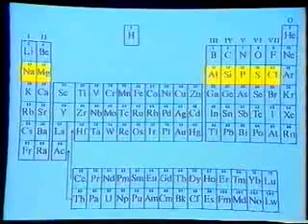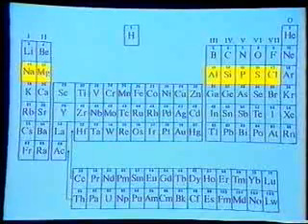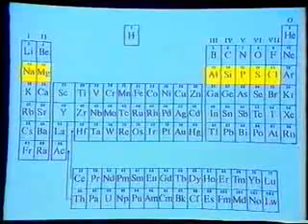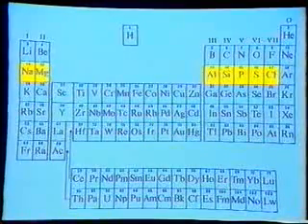In this program, we're going to look at some of the properties of the chlorides and oxides of the period 3 elements. You should be able to see trends as you move along the period. Have a pen and paper handy for making notes.